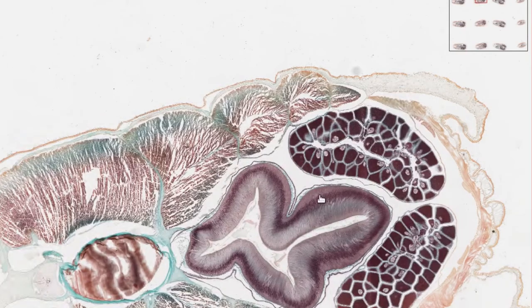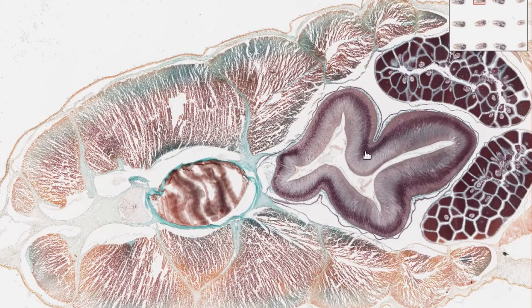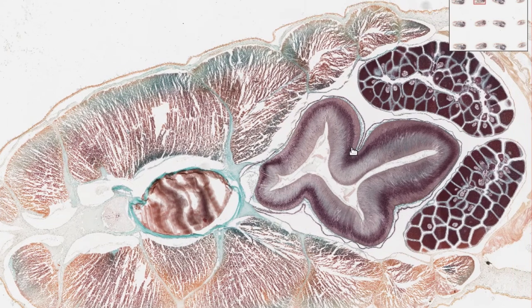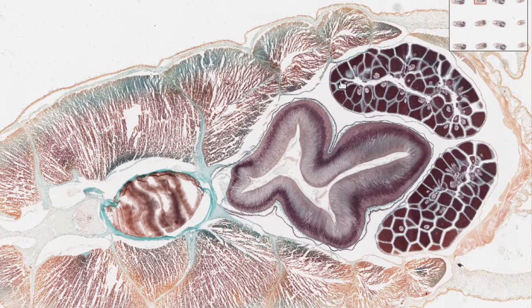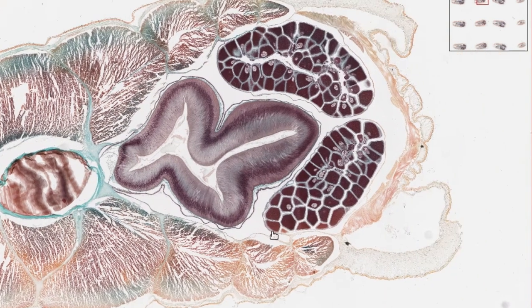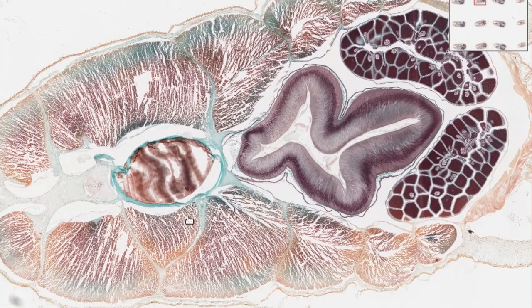Coming backwards then. This section is from more caudally. We've lost the pharynx and it's been completely replaced by this structure, which looks very similar to the hepatic diverticulum, but it's much larger. So this will probably be the midgut. We've still got ovaries here and some muscle, the dorsal nerve cord and the notochord.